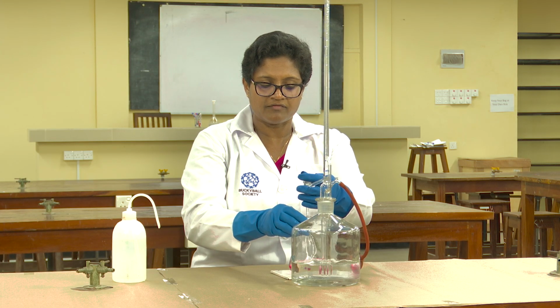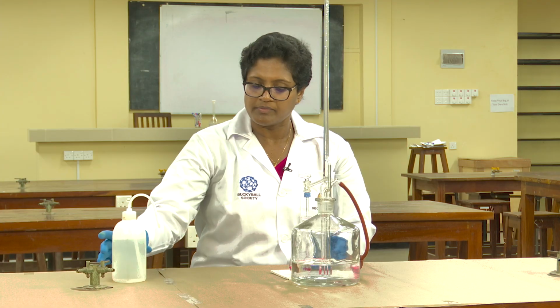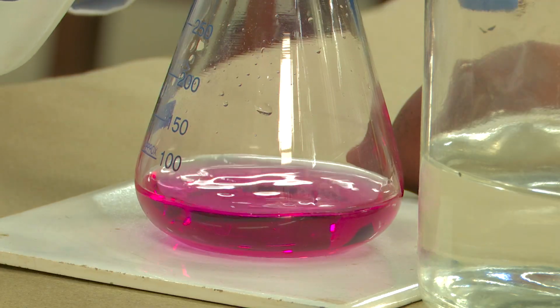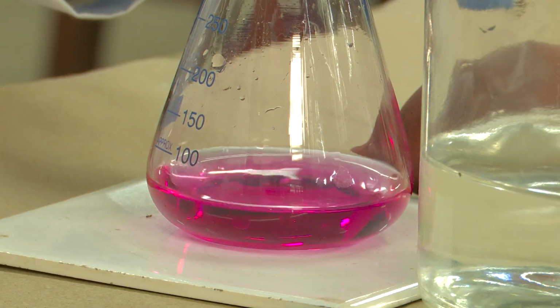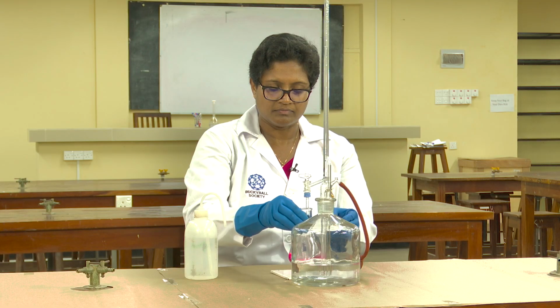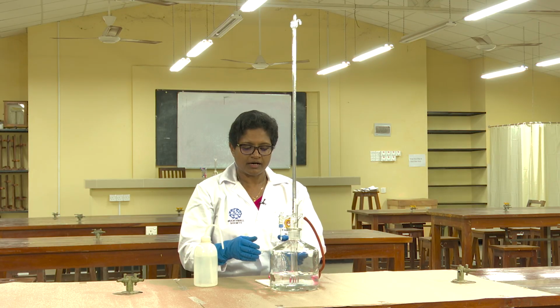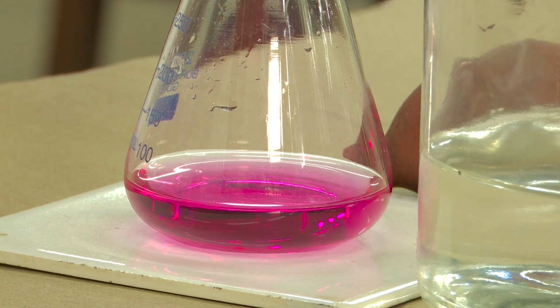Now you observe the color change from yellow to pink.